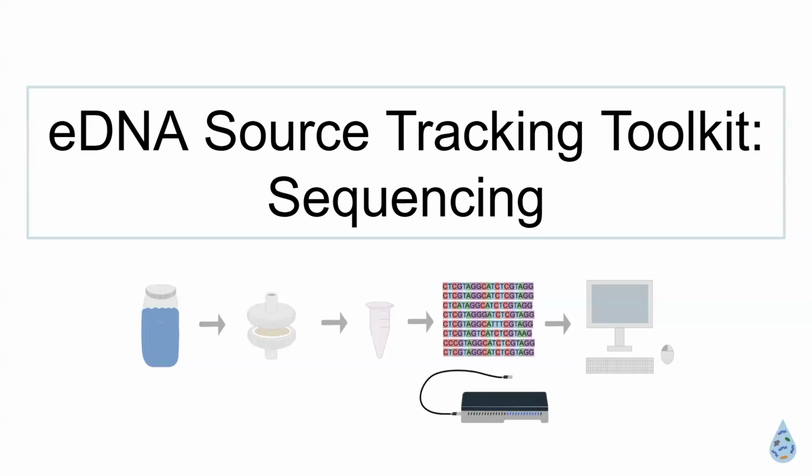Of course, we always autoclave anything that we can bring out, but you're right, with something like the Van Dorn sampler, we're not able to go back and re-sterilize it at home, but ethanol works great. And then continuing to rinse very well with the sample itself is just fine.